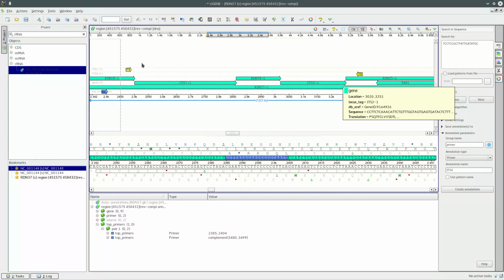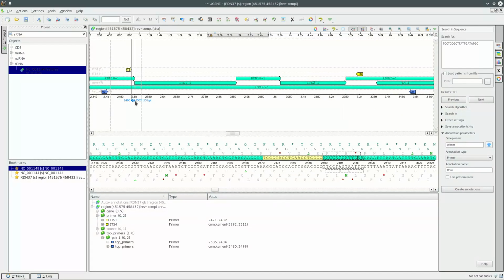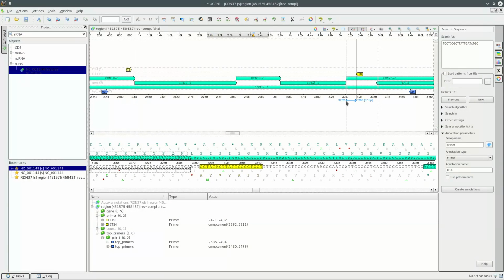And then it gets more reliable from about 50 base pairs out to probably 750 base pairs. Now, if you take a look at the end of the ITS1 primer and the beginning of the ITS1 gene, we're only about 12 bases away. So that means that the beginning of this ITS1 could have problems with the sequencing data. And if we go to ITS4 and the end of that one to the end of this one, we're only at 37 bases. So again, getting good sequencing data at the beginning of this region and the beginning of this region from these two primers might be problematic.